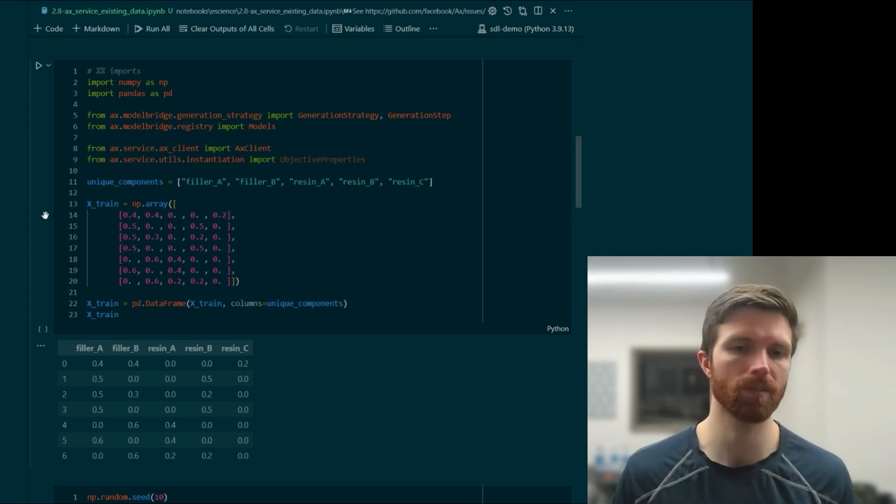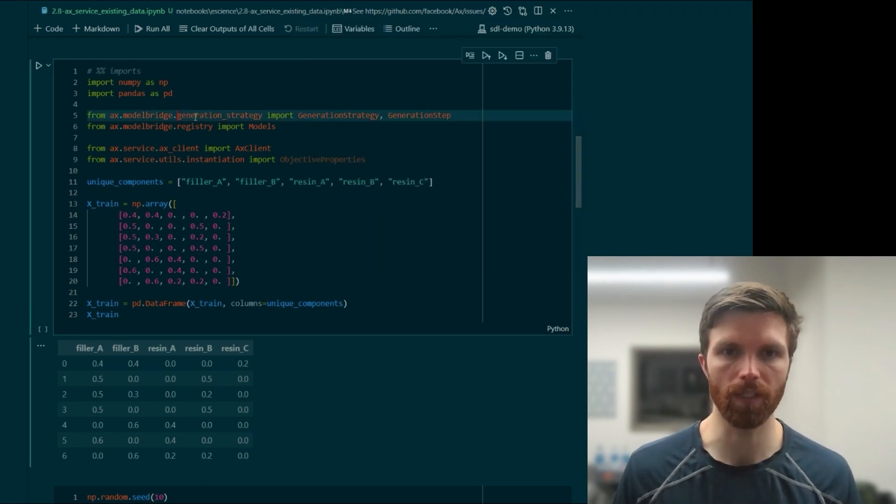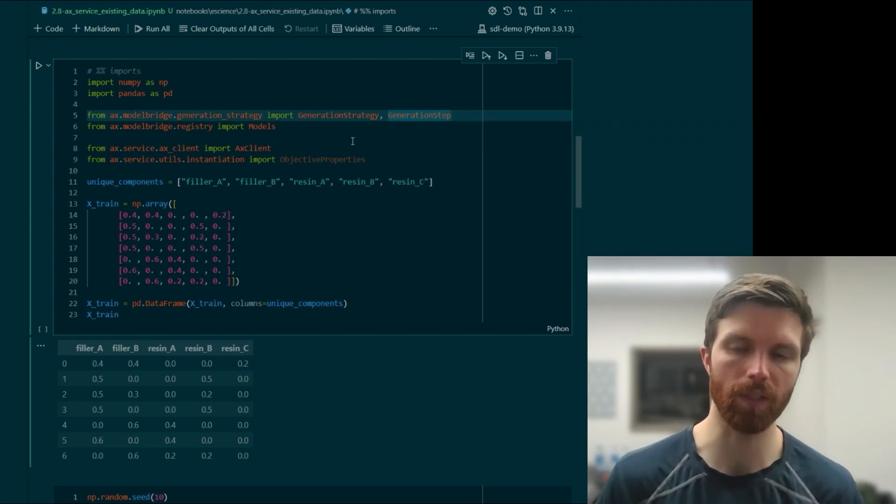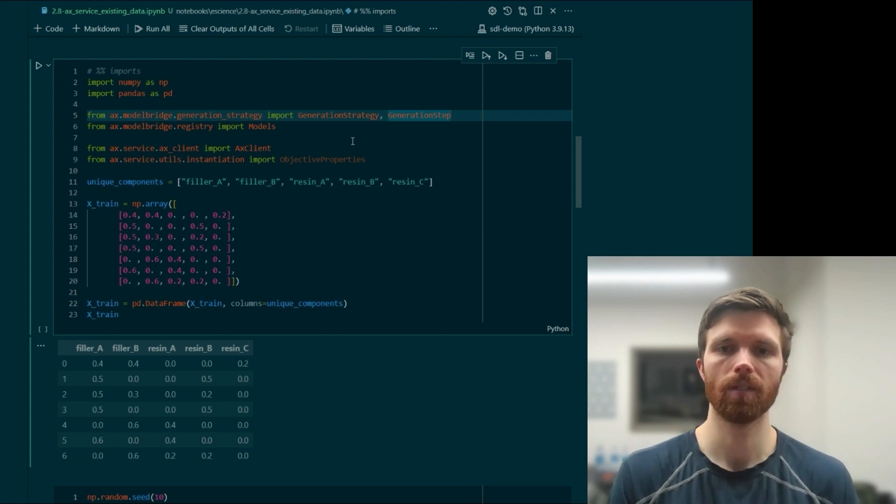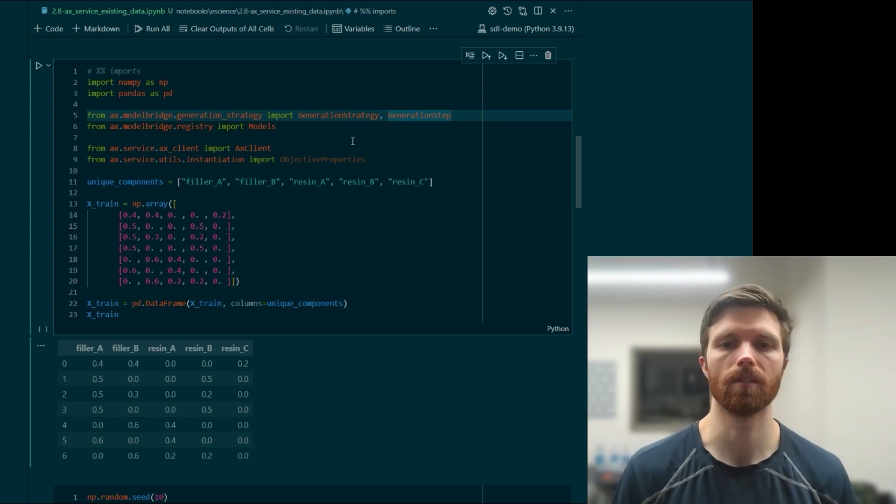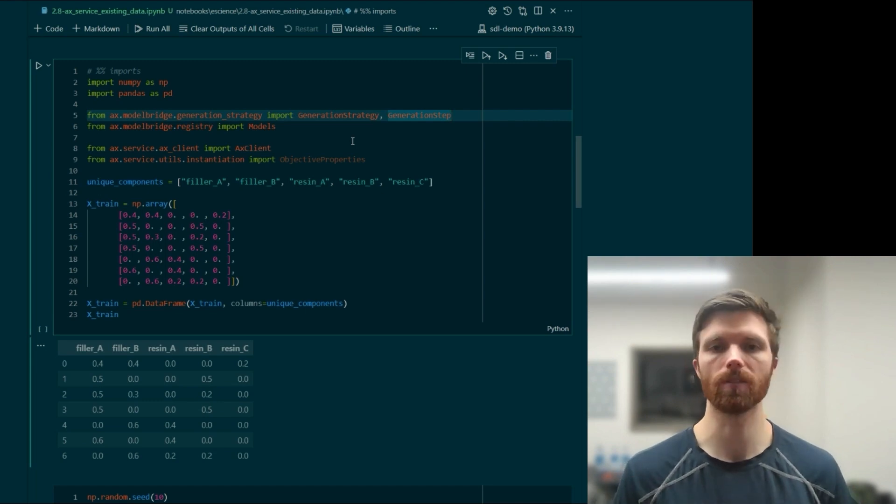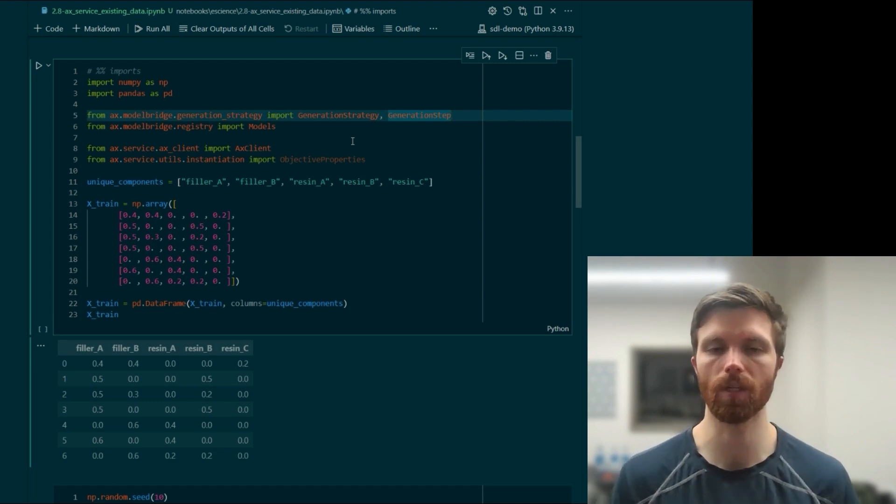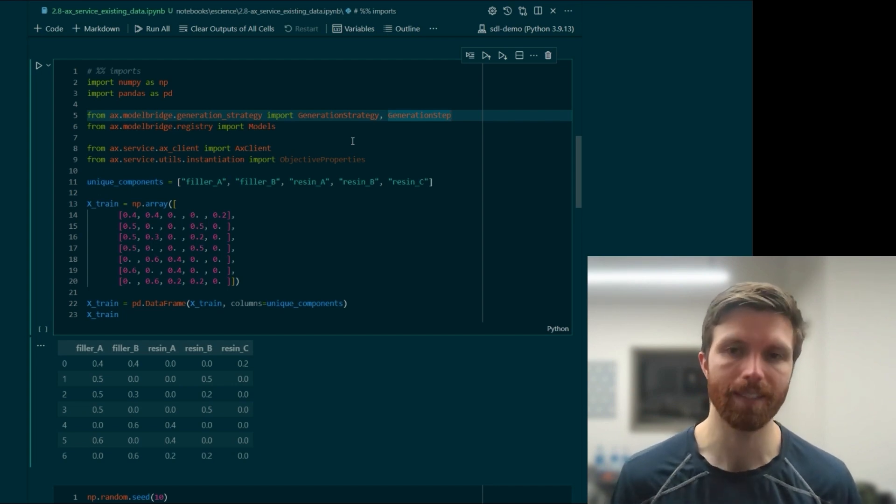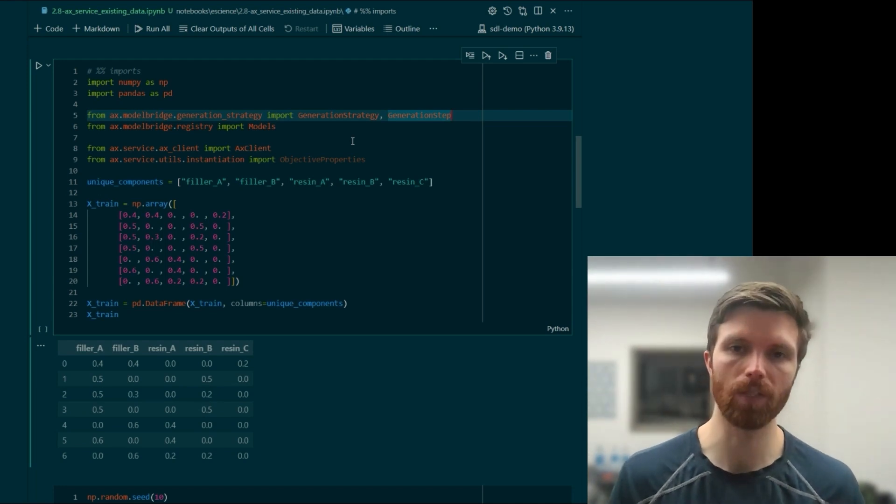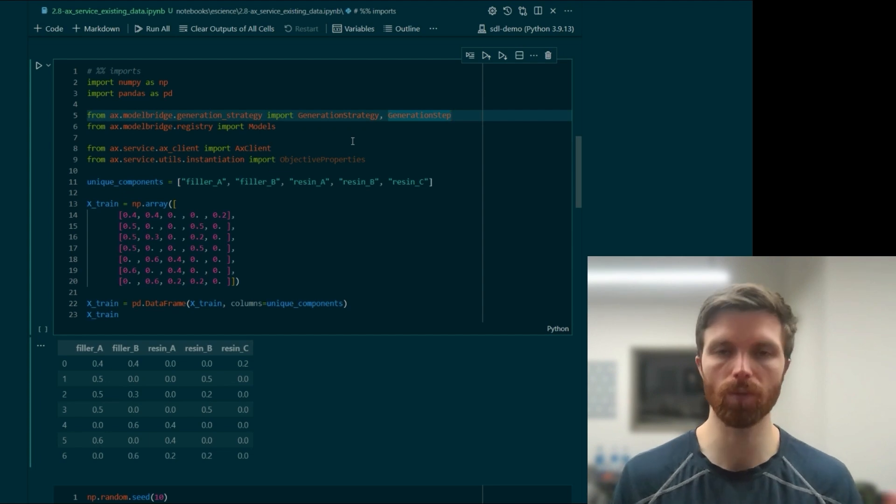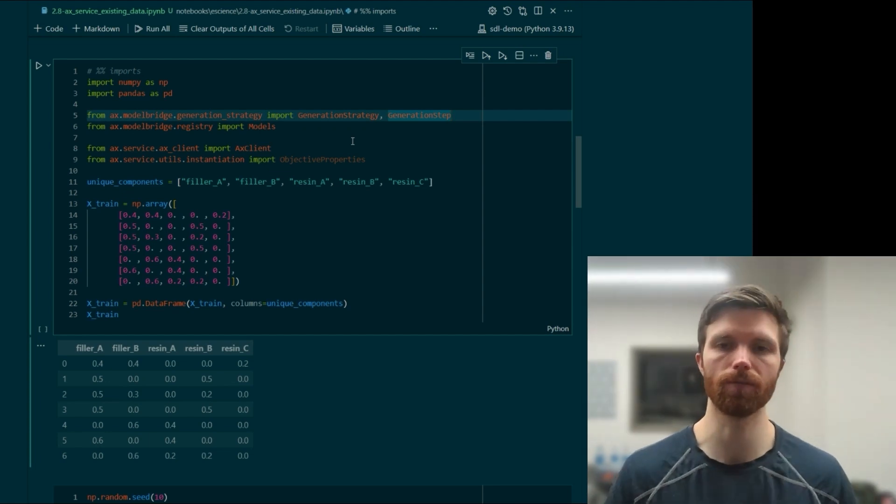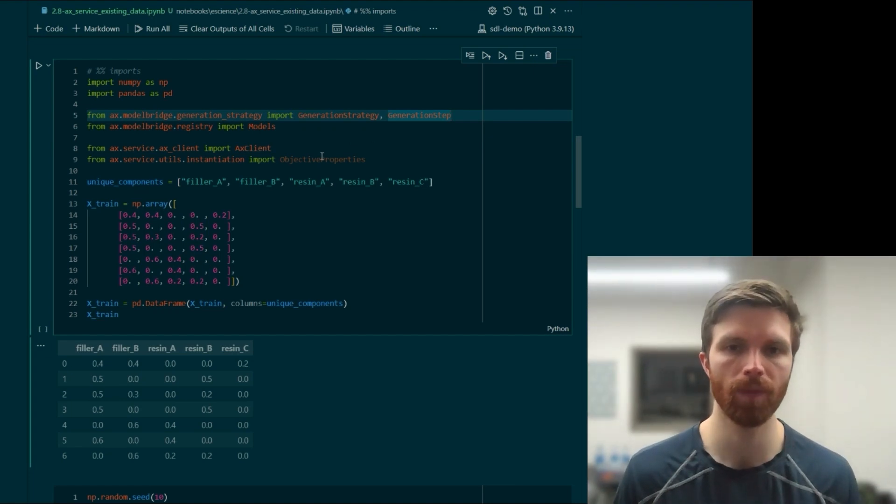Here we've got bringing in our generation strategy and generation step. We'll be using a custom generation strategy so that we skip the initialization with Sobol points. Depending on your experiment, you may or may not want to skip or reduce the number of the quasi-random search points. For example, if your existing data is highly concentrated, then it may be good to use some of the Sobol sampling points to get a better feel for other parameters in the search space that you've defined.